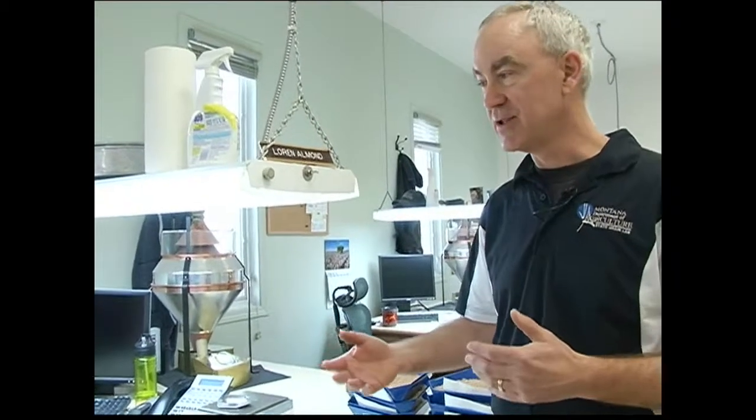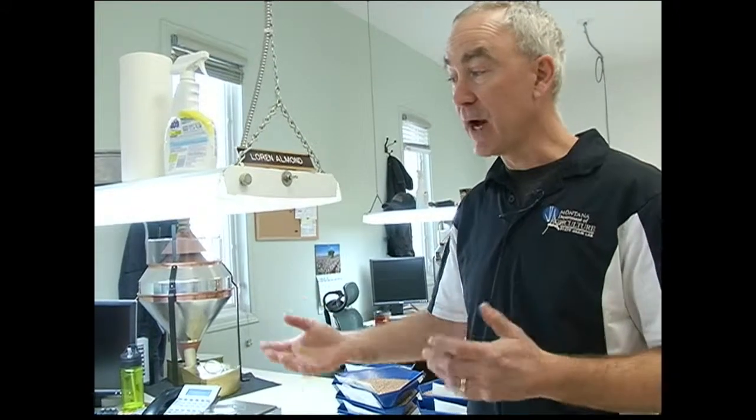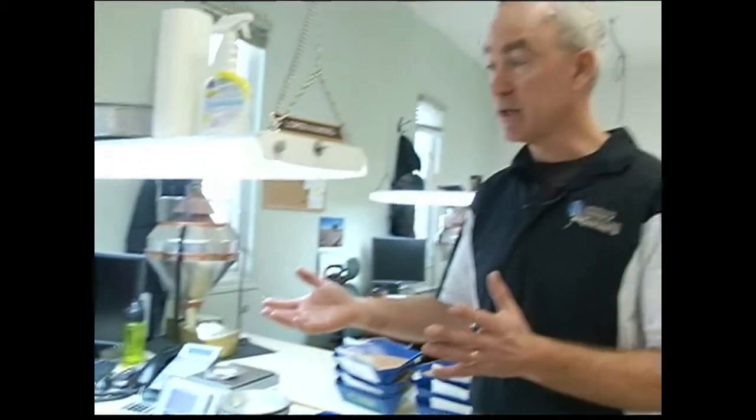Okay. Hard count, the technical term is DHV, dark, hard, and vitreous. And our normal 5-year average for hard counts in Montana is well over 90%. And that's really what Montana is known for, is spring wheat, high protein, vitreous, rich color. Good grain. Great grain, right? And that's what makes us distinct in our Asian market.